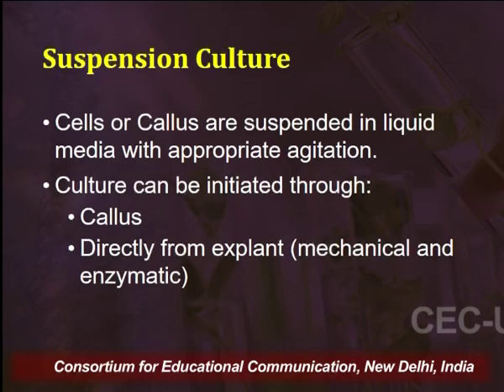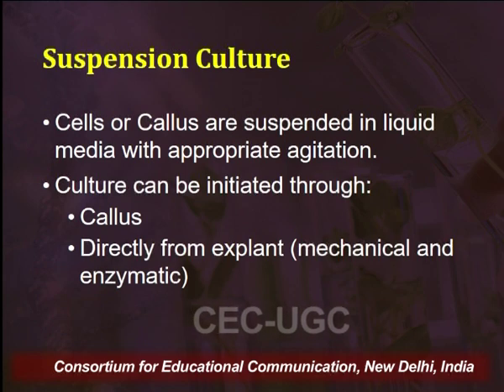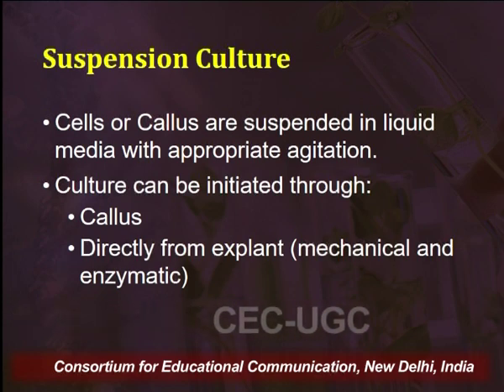Suspension cultures can be initiated through cells obtained from callus. As we discussed previously, callus is nothing but an undifferentiated mass of cells grown on solidified culture media. We can use that callus, separate those cells, and suspend those cells in a liquid media, thereby preparing a suspension culture.